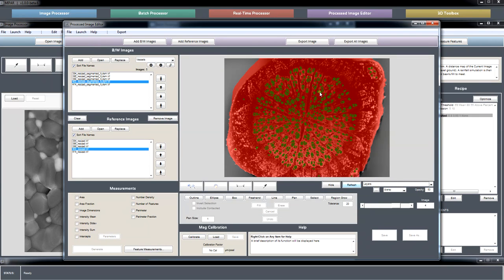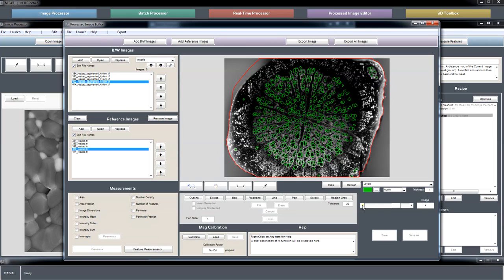You can look at the layers view, and you'll see this is green, indicating, just like this drop-down is, that the vessels is the selected layer, so any edits that you make or any measurements that you take pertain to the vessels layer, but you're still able to see all of the layers present at once, either in an outline or overlay fashion.